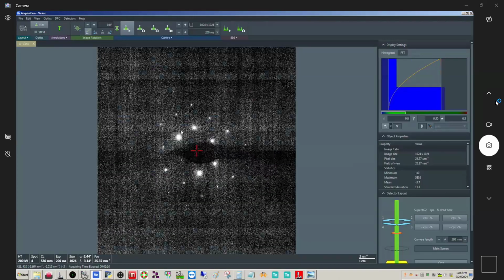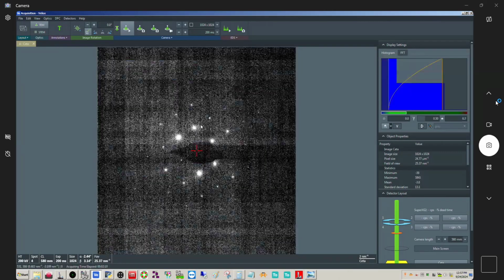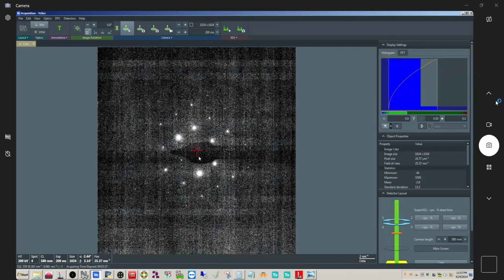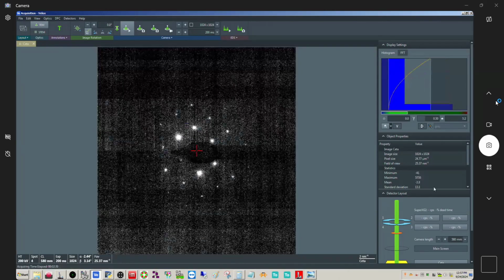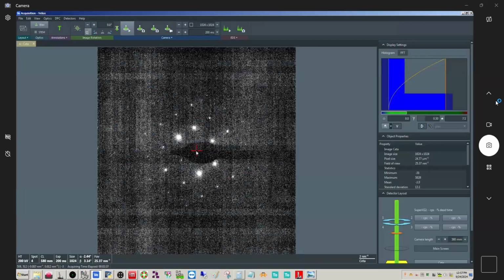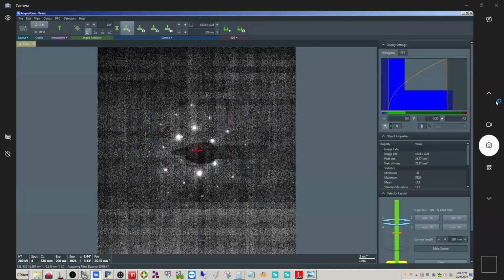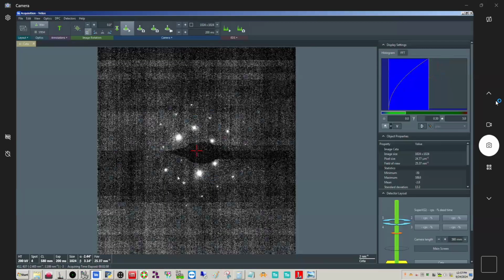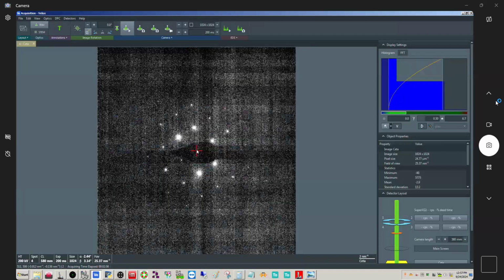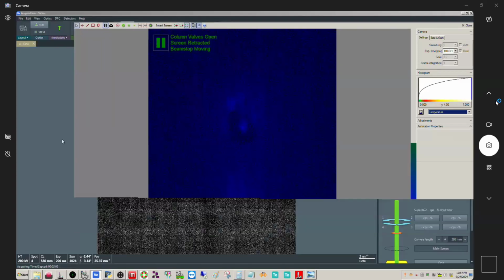So when you're strongly aligned with the zone axis, the direct beam may not be the max feature in the pattern anymore. It may be one of these other spots, and that's exactly what it looks like is the case here. With single crystals, if it's thicker, blocking the direct beam may not help you. If you're doing this with polycrystalline samples, absolutely, I would block the direct beam off because they don't scatter as strongly, and you're going to have a very intense direct spot. The rings are going to be far less intense compared to the direct spot. Same thing with an amorphous material, which is even more problematic. I definitely want to block the direct beam in that case. Anyways, let me go back here and take that out since it wasn't helping us at all.